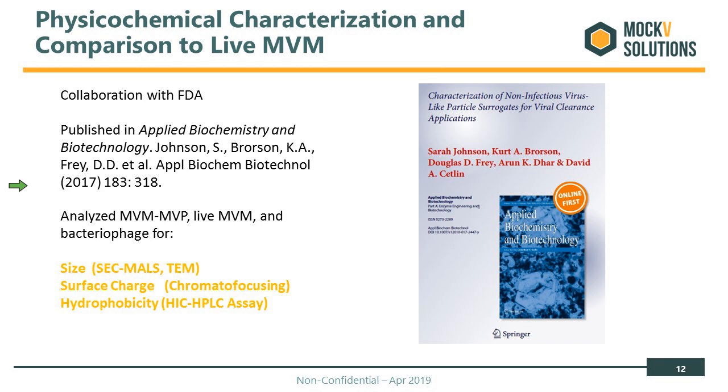The first study we conducted, the first collaboration, was with Kurt Brorson's lab at the FDA. We asked the question, how do our particles mimic the physicochemical properties of the live viruses that we say they represent? So we provided his lab with our non-infectious particle along with live MVM, and we also used PP7 bacteriophage as another test object.